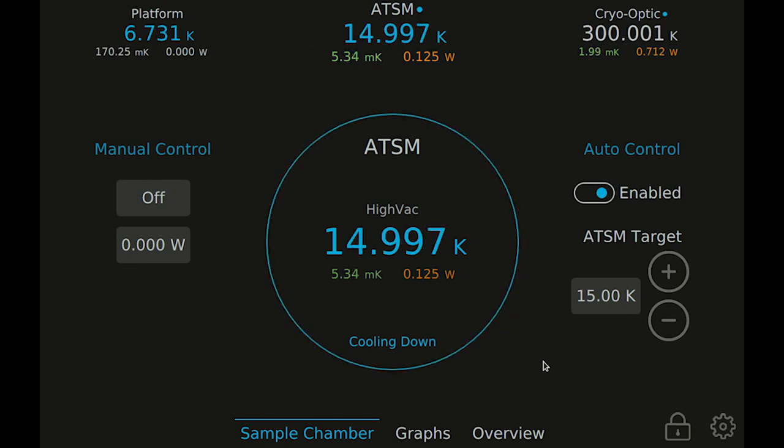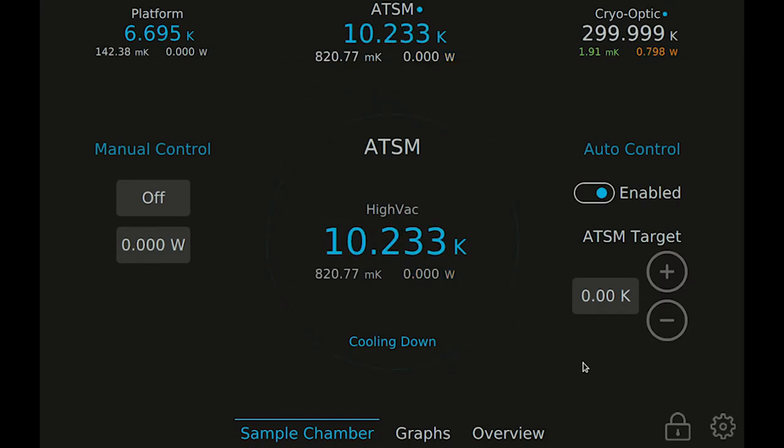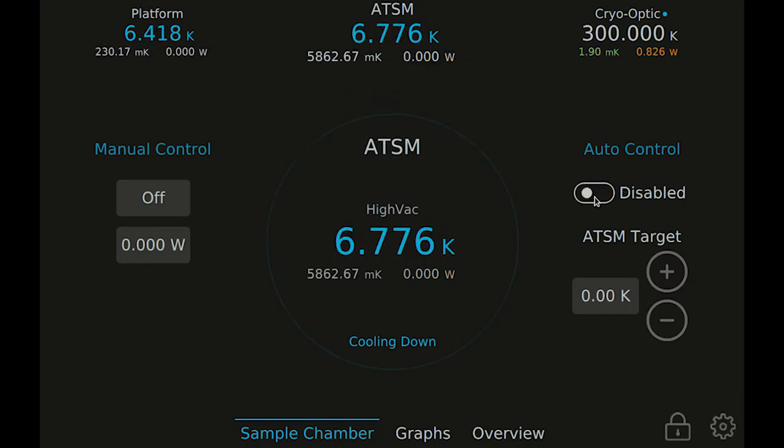To let the sample go to the lowest base temperature, you can either set the target to zero or disable the controller. You can also apply direct heater power manually.